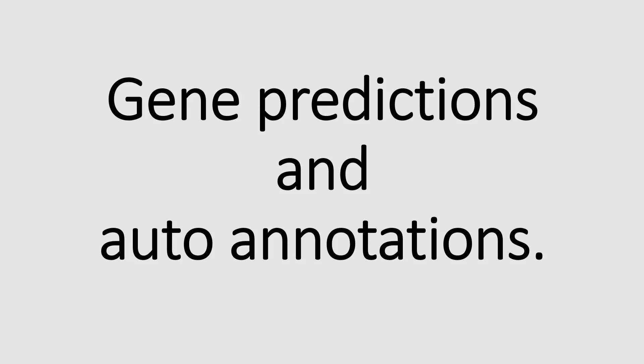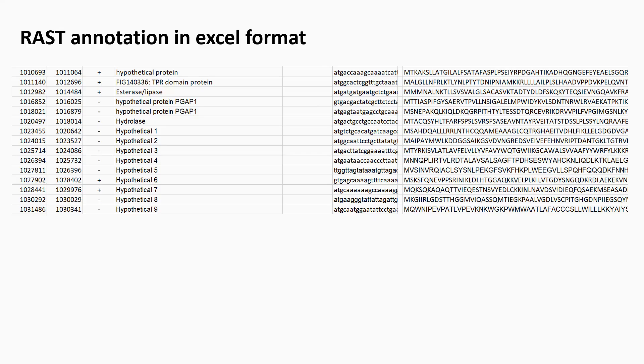I was just going to do a video on gene prediction and auto annotations, something that I noticed recently when looking through some genome data. I quite like working in Excel with RAST annotations just because I find it easy to extract the information from the annotation.